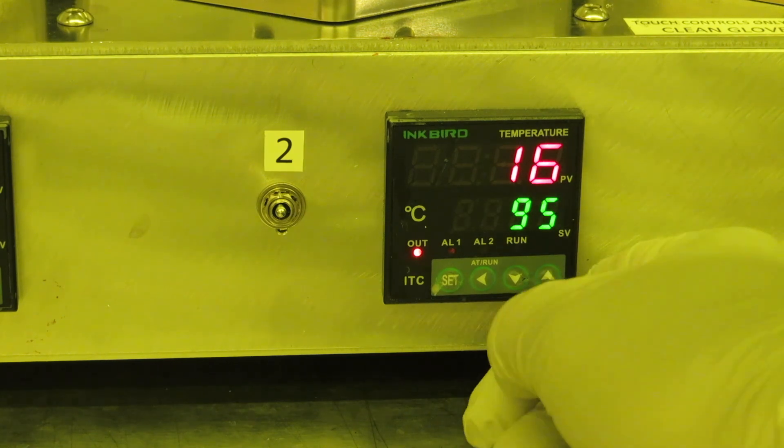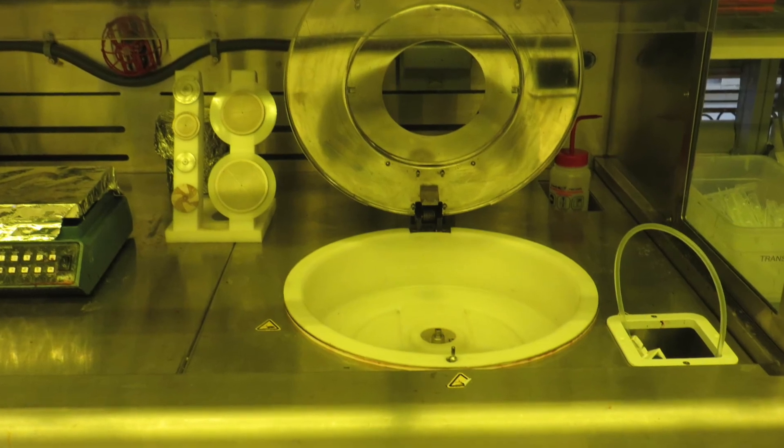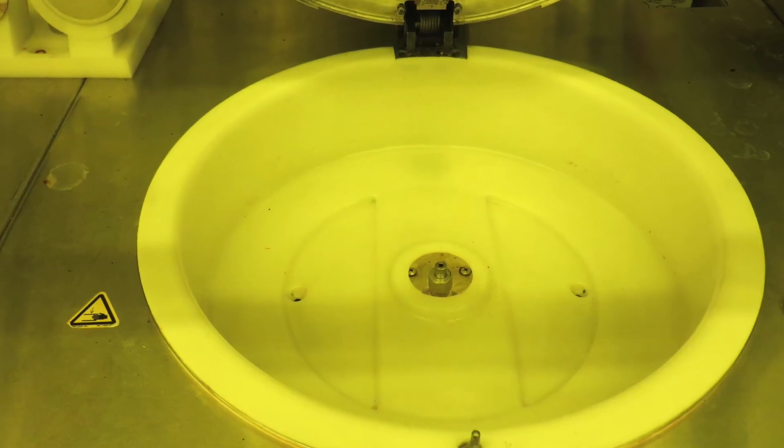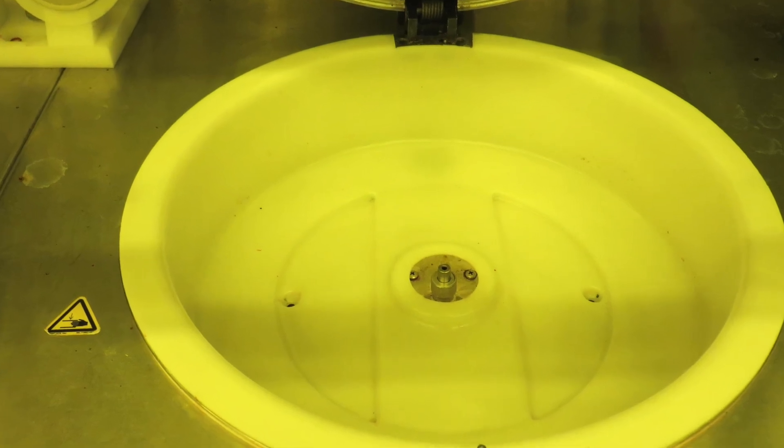The spinner is capable of speeds up to ten thousand RPM, although we rarely go above six thousand RPM. It is very important that you are wearing safety glasses while you're spinning in case a wafer flies off and shatters. You should always have the lid closed during spinning, although I will have it open for demonstration purposes.